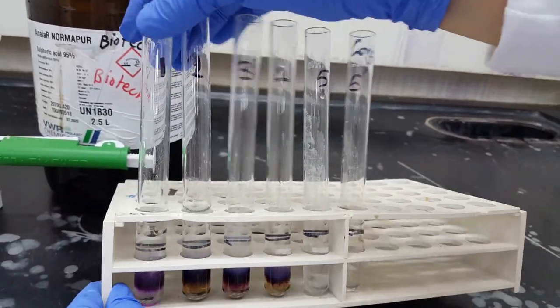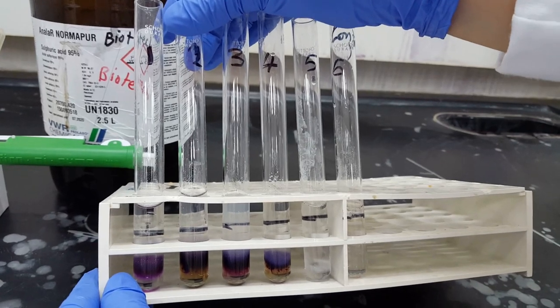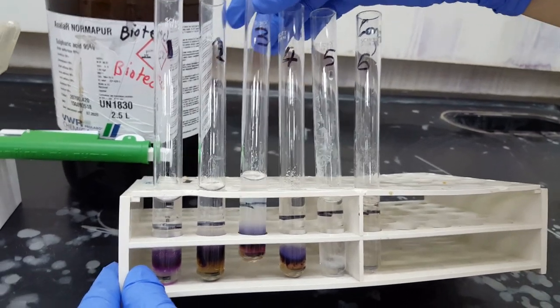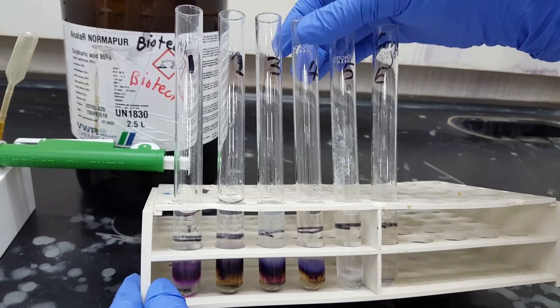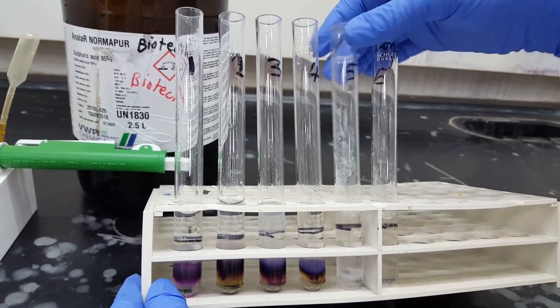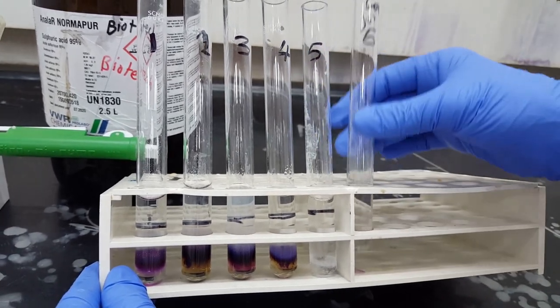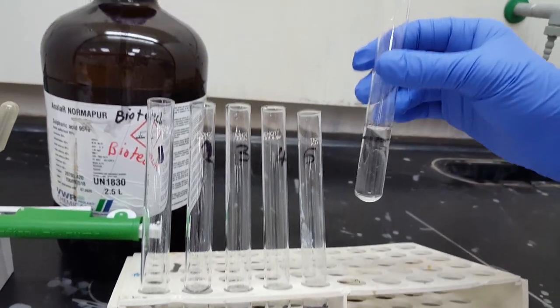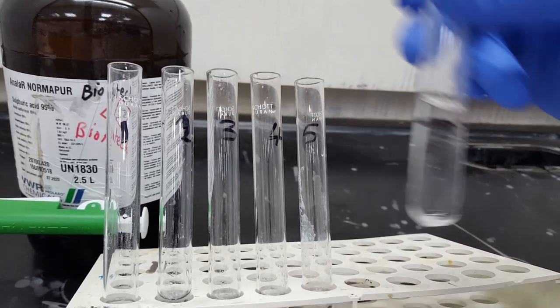The first test tube has the glucose. The second test tube, what does it have? Fructose. And the third one has the sucrose. The fourth test tube has our first unknown, and the fifth one has the second unknown. The sixth test tube has what? The water. The water has no carbohydrates, and that's why we cannot see any ring.